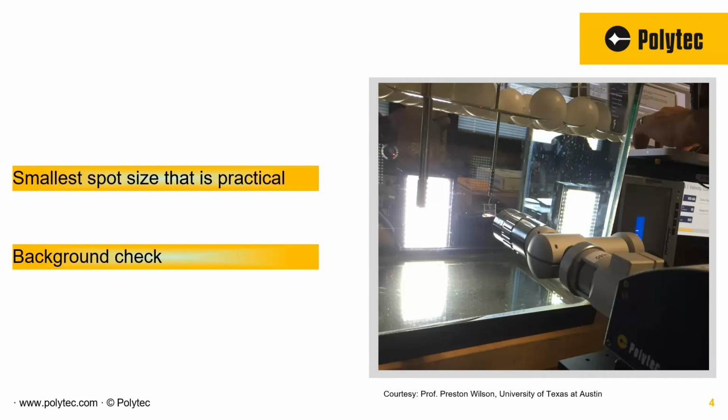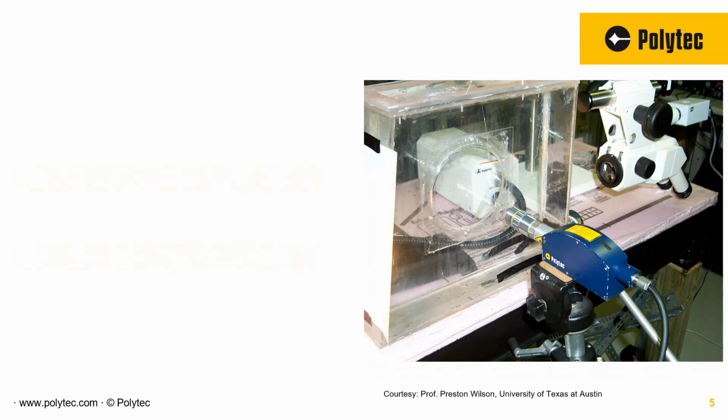It's also a good idea to do a background measurement without excitation, so then you know what is coming from the glass. I've also done measurements by actually focusing on the glass itself to see what effect the glass could have on the actual measurement. If you notice that even when you're focused on the glass the effect is negligible, you can rest assured that when you're not focused on the glass, you're going to get good measurements.